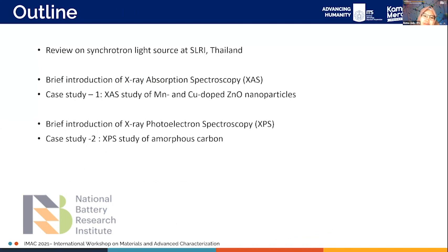So here is the outline of my talk. First, I would like to review the synchrotron light source at SLRI Thailand, and then a brief introduction to XAS, which was already explained very well by Professor Ichikuni. Then I go to the first case study, a local structure study on manganese and copper doped oxide nanoparticles. Then comes X-ray photoelectron spectroscopy, only a brief introduction. And the last one is to discuss an XPS study of amorphous carbon.